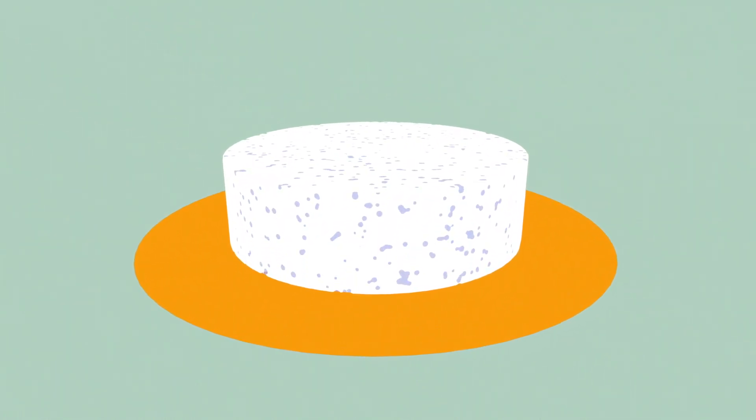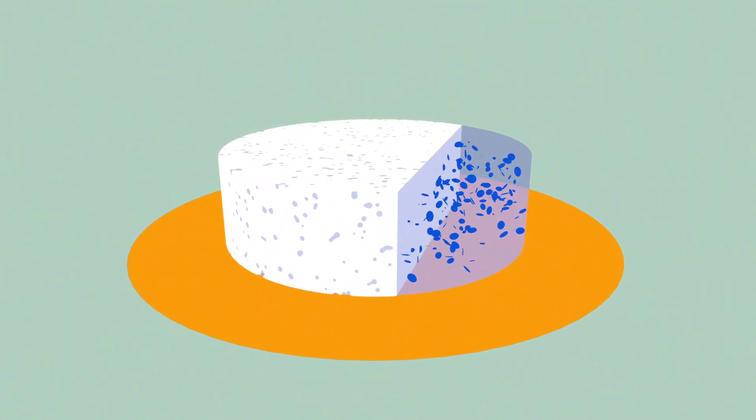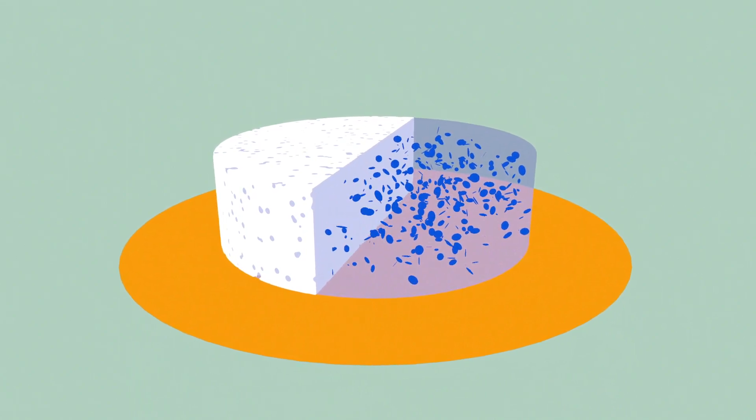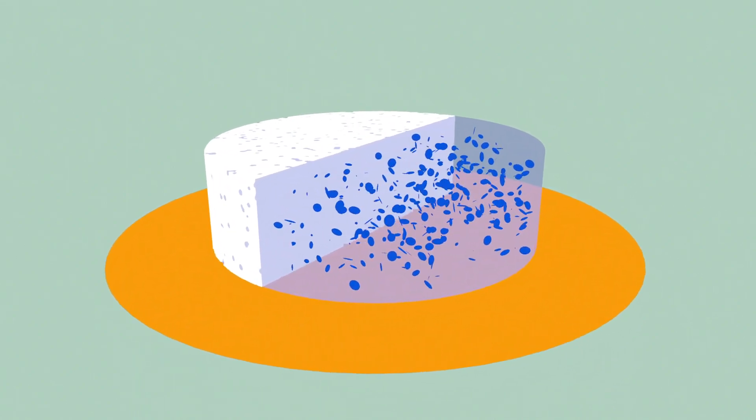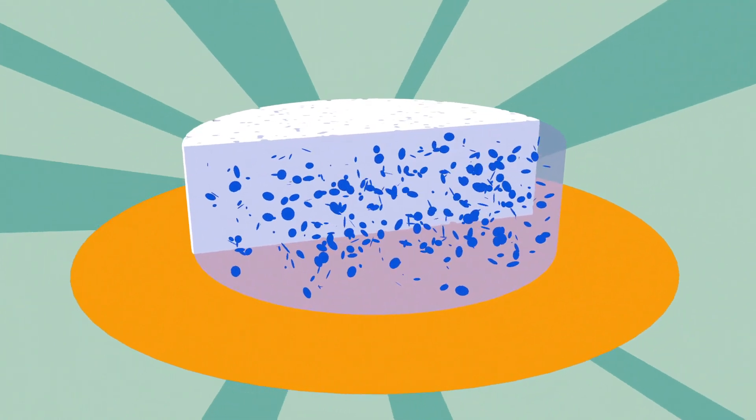But what if analysis could be extended beyond the surface? What if investigations could be performed deep into the sample, revealing the three-dimensional structure? What potential could be unlocked to push material properties even further, or to induce new properties?